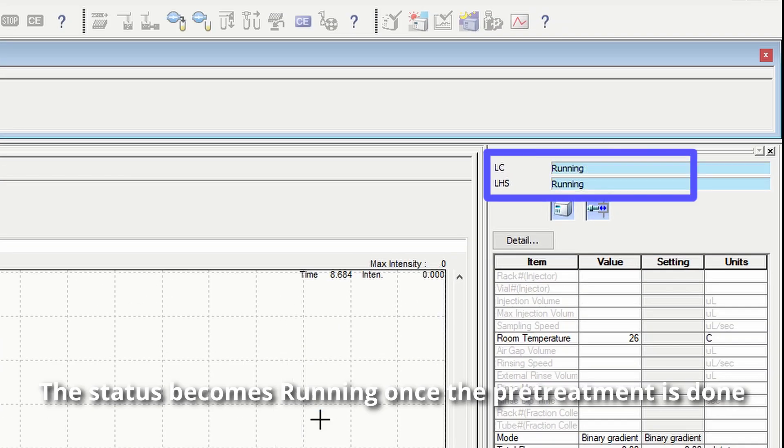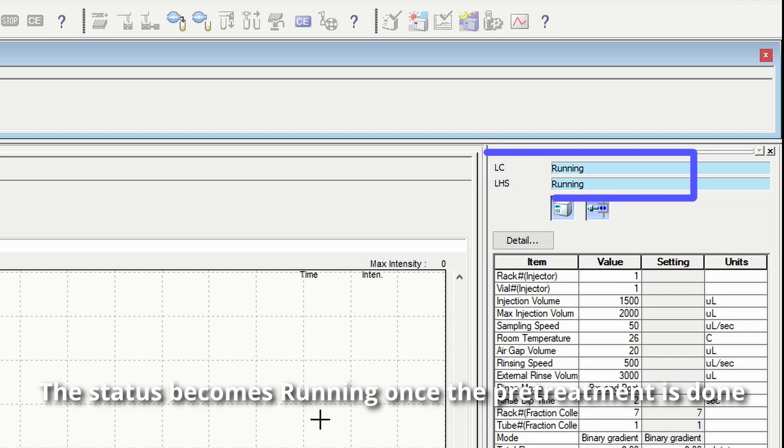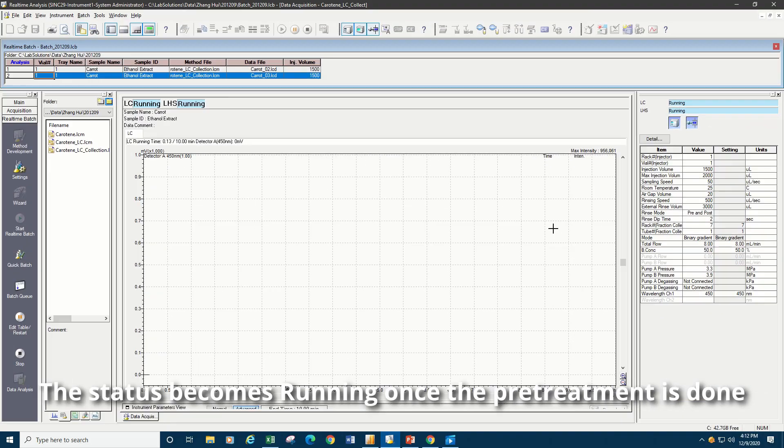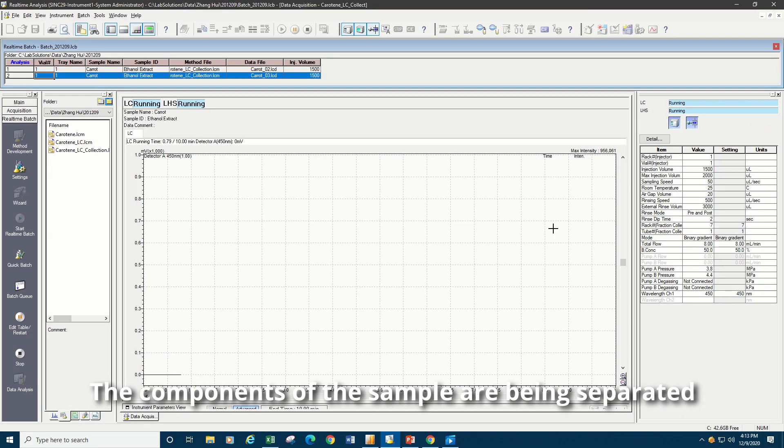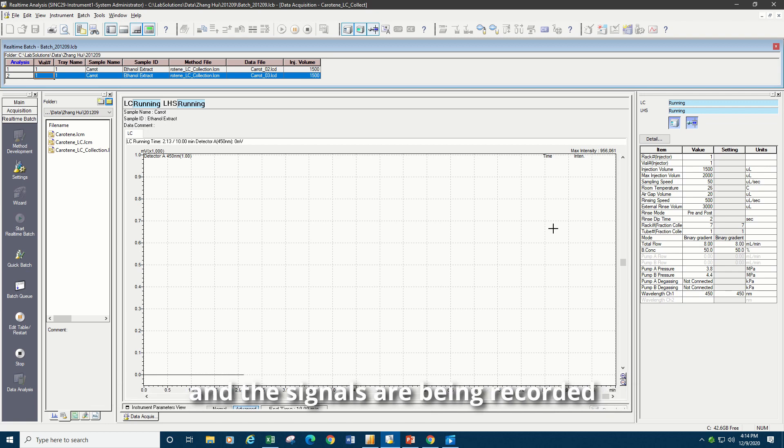The status becomes running once the pre-treatment is done. The components of the sample are being separated, and the signals are being recorded. The real-time chromatogram can be monitored in the chromatogram view window.